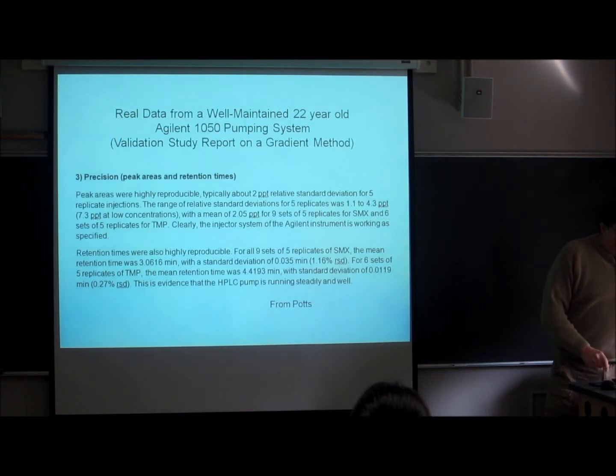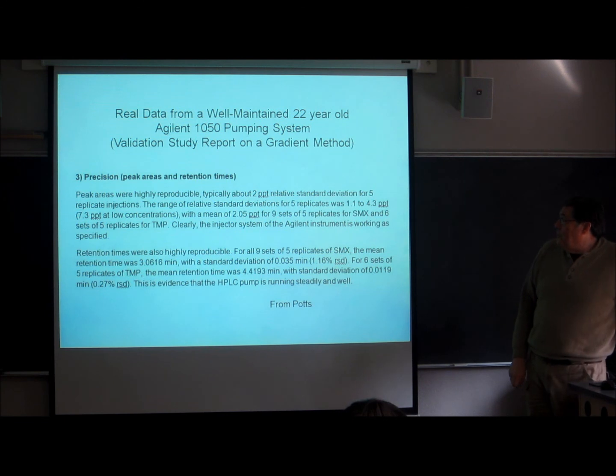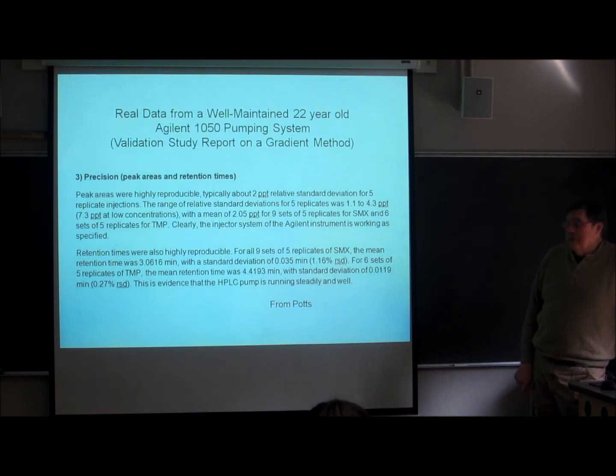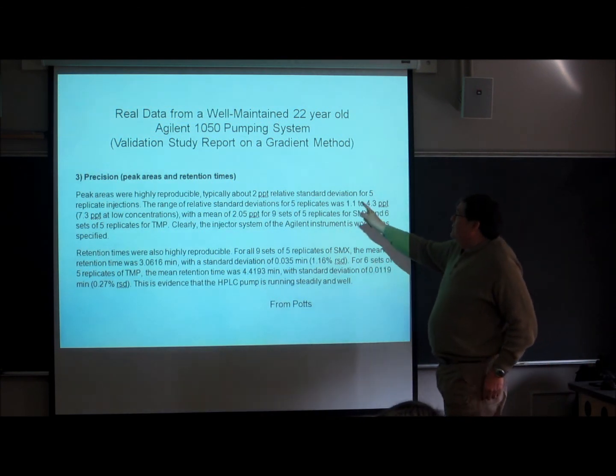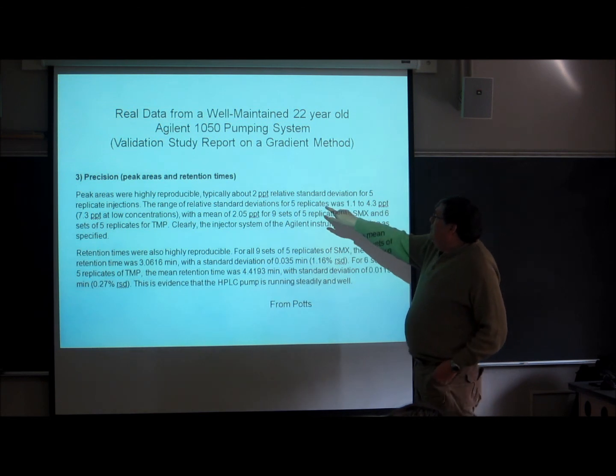We would want to measure the reproducibility of the retention time. Okay, and this is from some consulting work that I did with a company down in St. Peter that makes drug mixtures for veterinary medicine, and they have to do quality assurance tests all the time. So this is checking out the instrument, and now there's a lot of words in here.